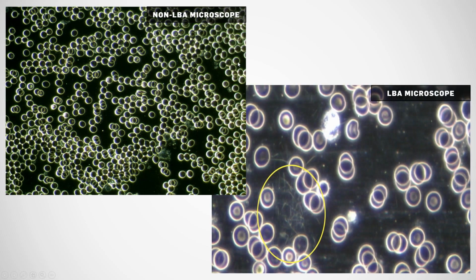So compare this to what we should actually get with a proper dark field microscope system. It's not the same sample, but a similar type of sample. So we could easily have encountered areas of fibrin precipitating like this in the sample, but at this magnification and with this type of dark field system, it's simply not visible. So you're missing a lot of the information, the vital information. Absolutely, there's so much information that you're missing here that we simply don't know, because you're not able to actually see what you really should be able to see. So the magnification is not what it should be.